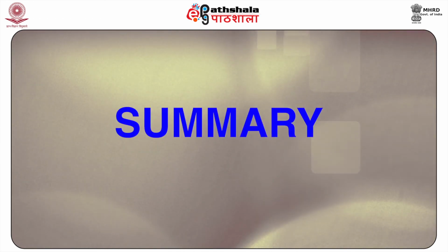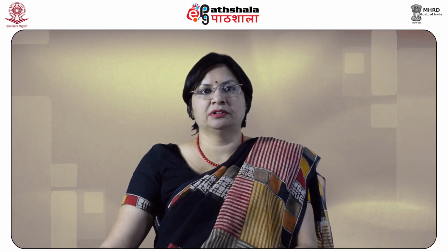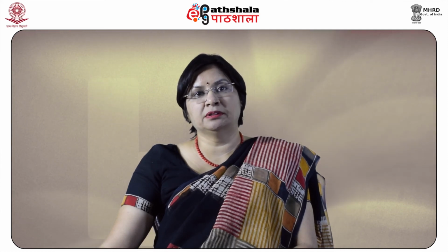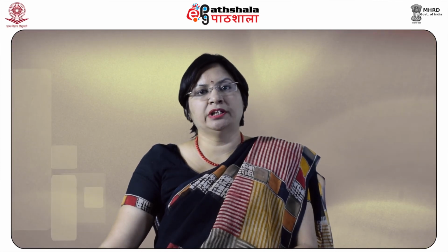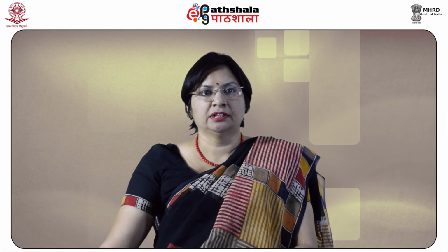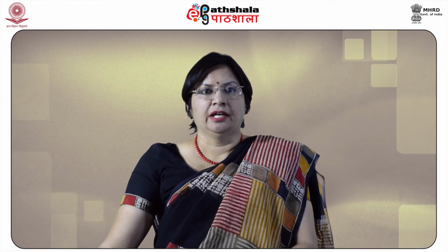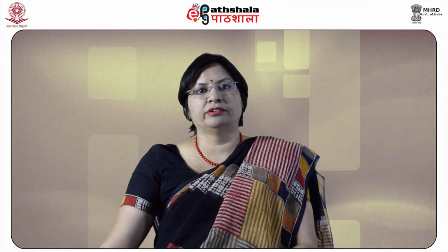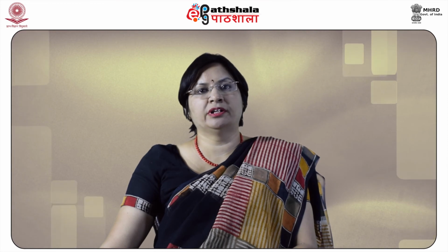Let us now summarize what we have learnt in this module. In this module focusing on chromatography in the forensic chemistry paper, you have become familiar with chromatography, its principle and its various types. The term chromatography is actually a combination of two Greek words, chroma meaning color and graphein meaning to write. And we have learned that it is the term which is used collectively to refer to all the laboratory techniques which are employed in the separation of different components of mixtures.